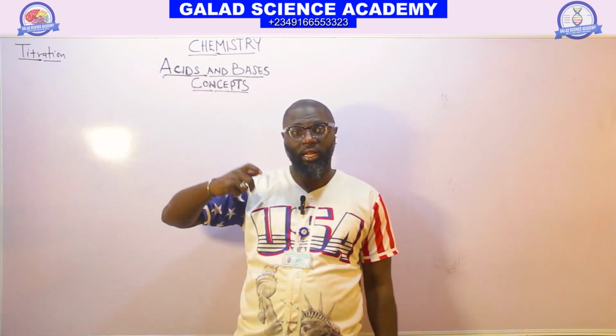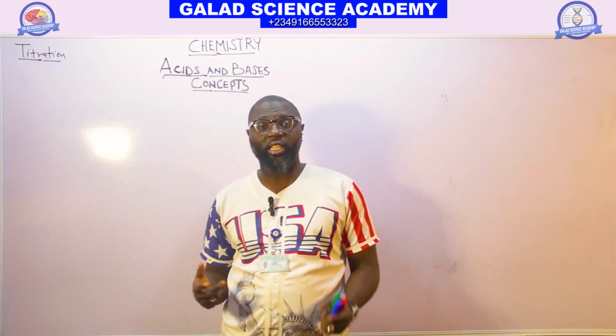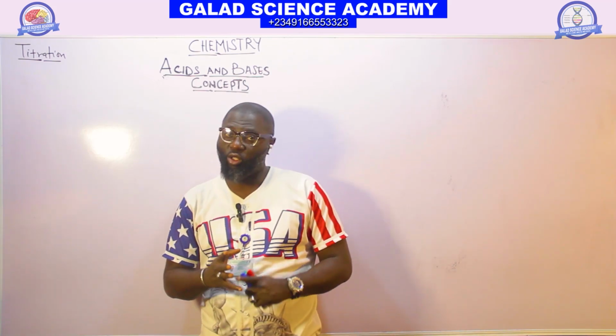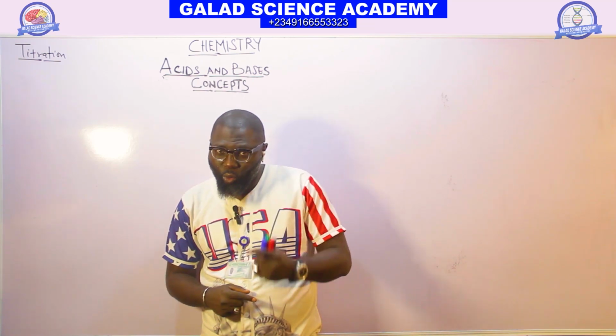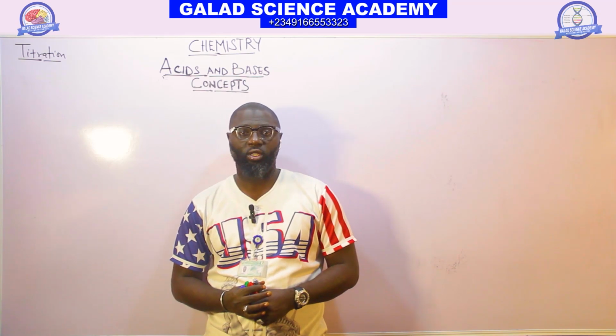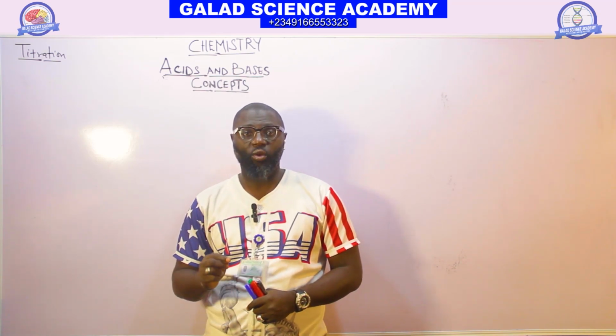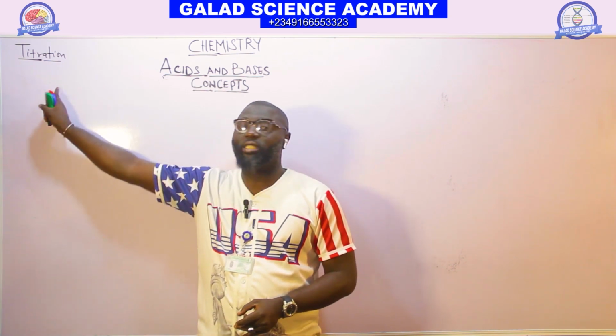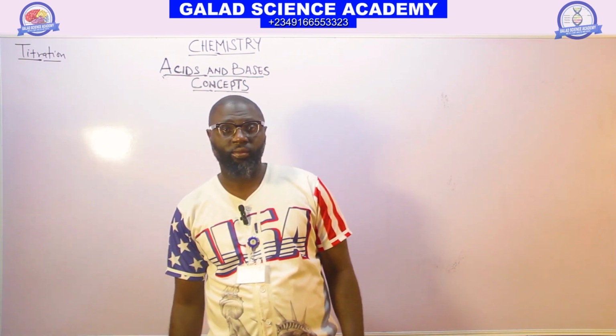It is a laboratory technique that we use to determine the unknown concentration with known concentration in the presence of indicators. That is what titration is.